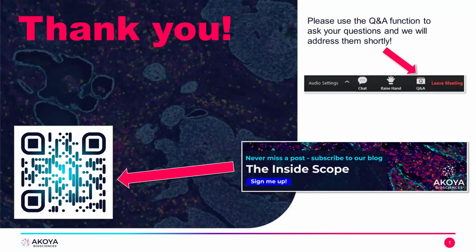Can you analyze different regions of interest separately, or is it a whole image analysis? So you can do both. We have users that choose different regions of their tissue that they're really interested in. We have people that are working on TMAs, so tissue microarrays, where they're selecting which of the cores they're looking at. And then we have groups that are using the whole cover slip. So they're taking basically a full biopsy sample or a full section of tissue and then analyzing from there.